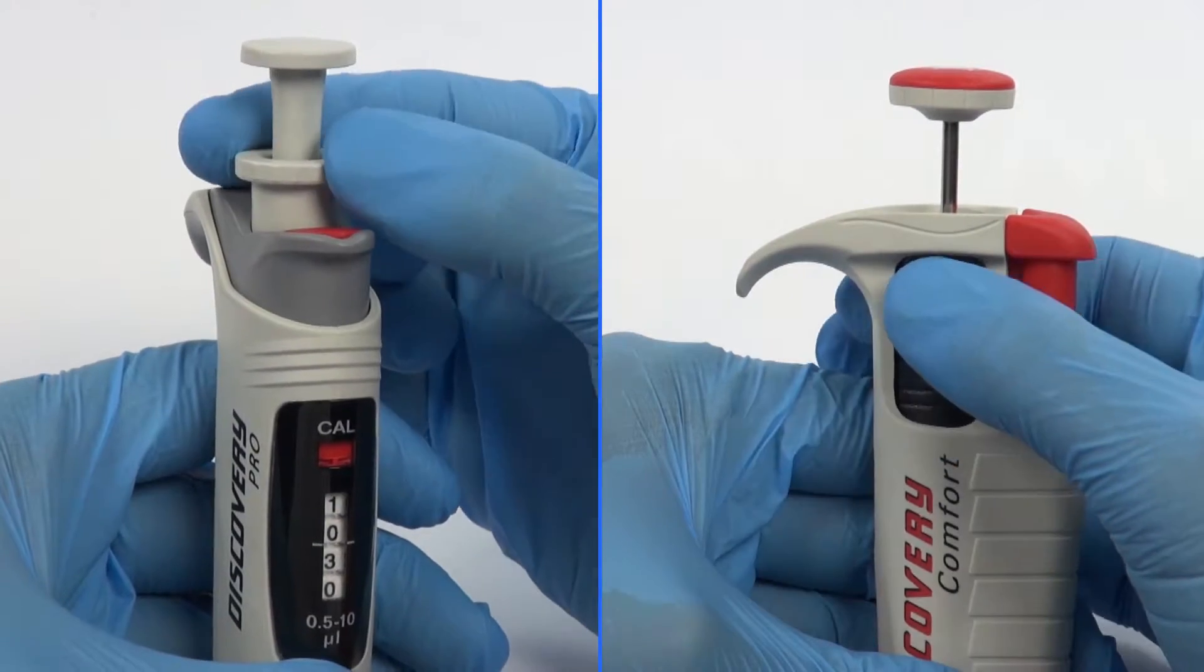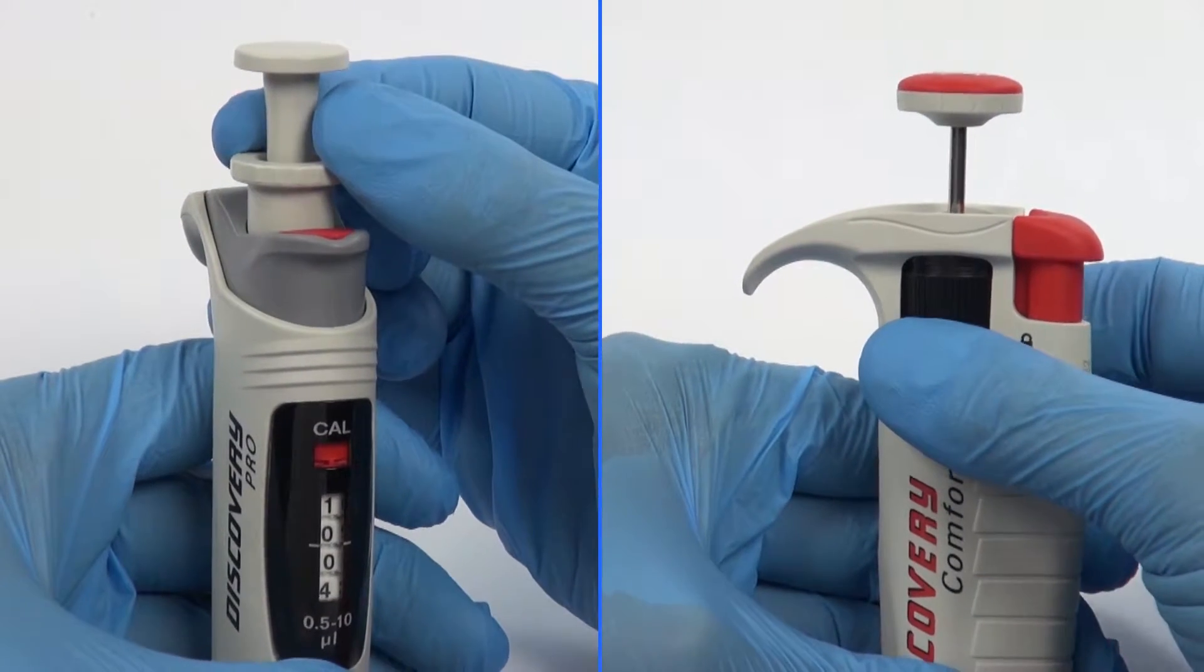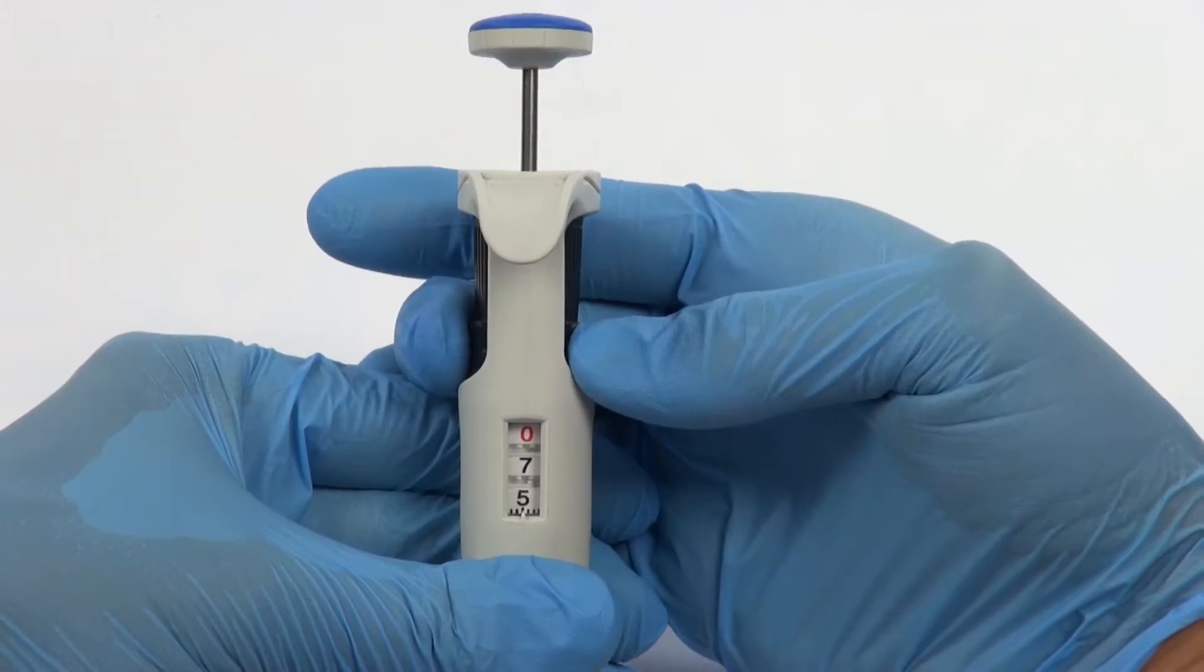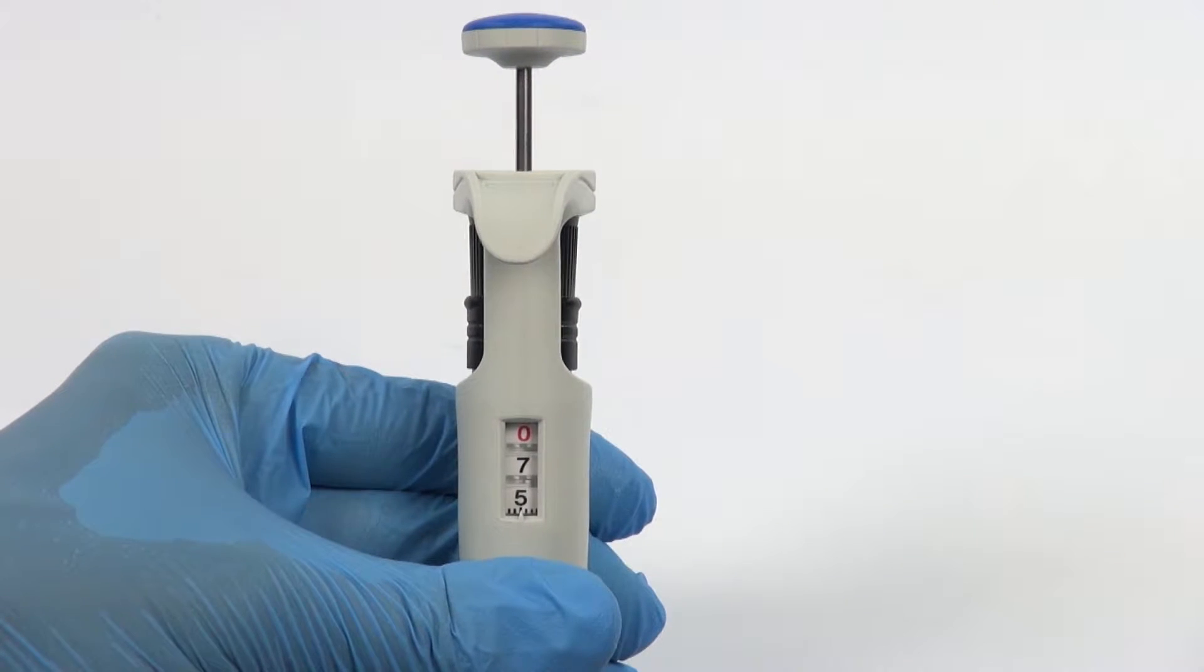Additionally, Discovery Comfort and Discovery Pro pipettes are equipped with a volume lock mechanism. The volume shown on the counter is represented by three or four digits, which should be read from top to bottom.